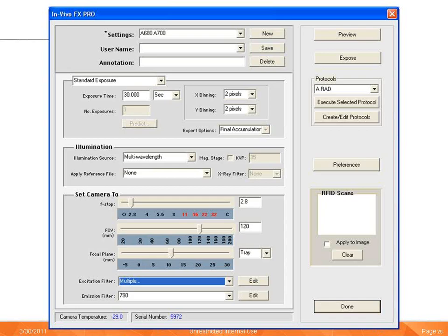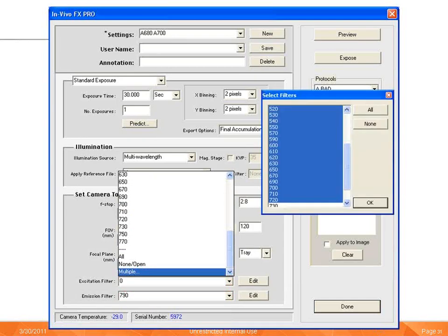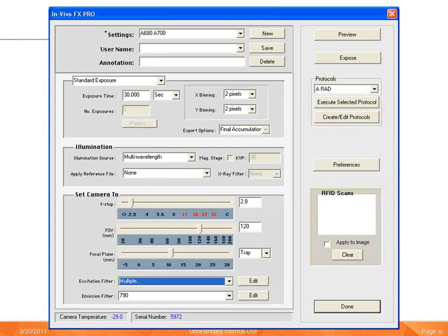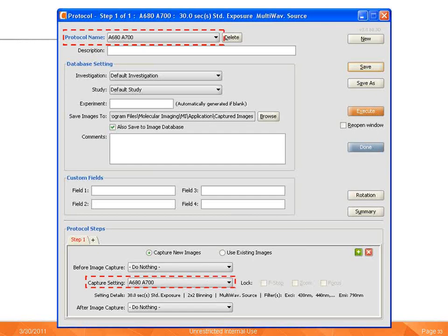We'll next generate a capture setting using the CareStream Molecular Imaging software. The 790 emission filter is selected, and 'Multiple' has been selected from the excitation filter pull-down menu. We're provided with a selection box for multiple filters. The desired filters ranging from 520 to 720 have been selected, and we select OK. In order to execute a multispectral acquisition, we need to generate a protocol with the capture setting included. The software presents files in a format compatible with the multispectral software only when acquisitions are run through a protocol. In the protocol view, we've generated a protocol name and selected our previously defined capture setting for a multispectral acquisition. Then we execute our acquisition.